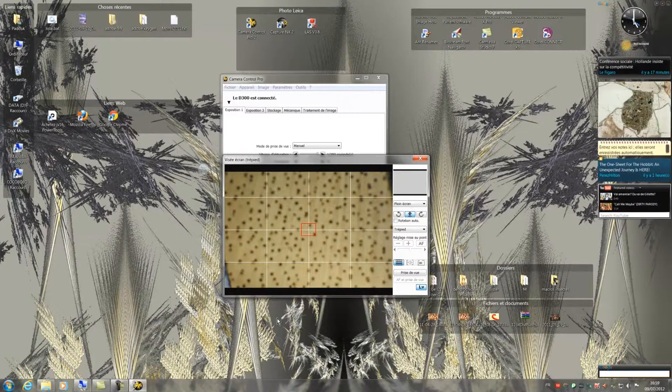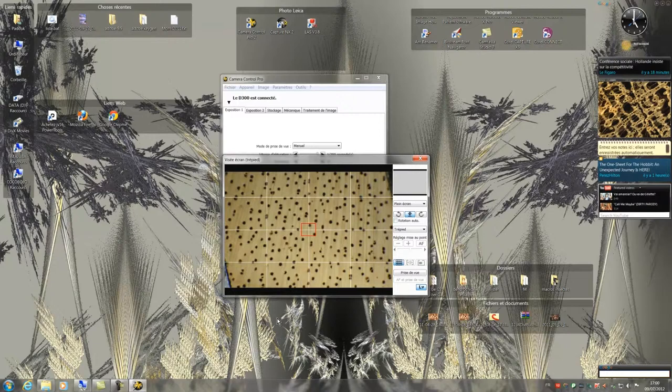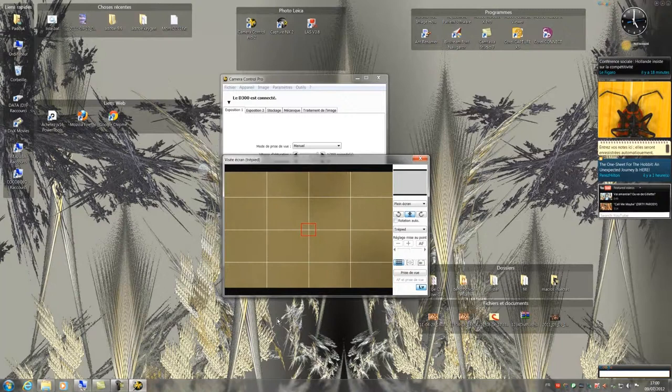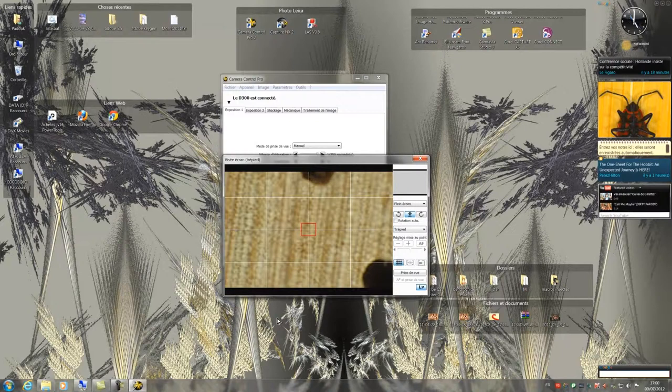Now I will start to adjust the sharpness. To refine the sharpness, I must increase the zoom to its maximum position. Now we have a better sharpness.